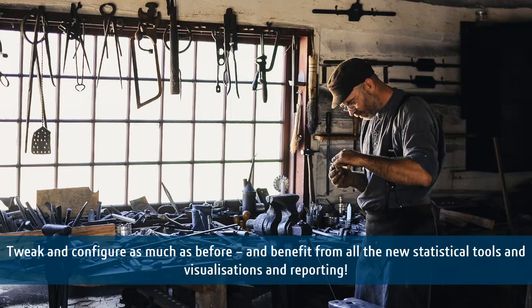And once again, I'm repeating myself, but it's very important: these functionalities, being able to add your own automatic invalidations, reportings, etc., won't only be available when you do a completely automated analysis.